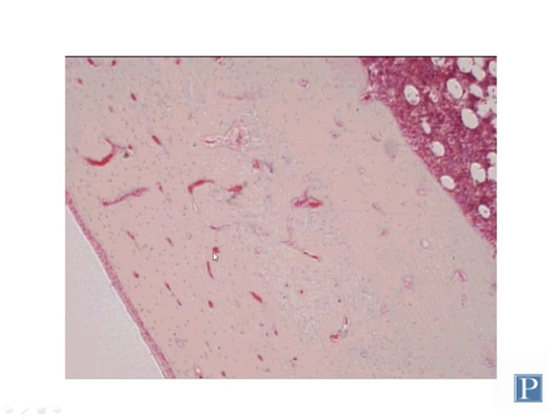So here's the actual compact bone structure, and the advantage of preparing this section with decalcified bone preparation is that it spares or retains the living part of the tissue, which are all of the cells. So you can see compact bone is riddled with little pits or lacunae, just like within cartilage, because again the matrix here is solid, and within those lacunae there are cells. Now at this low magnification it's difficult to see those.